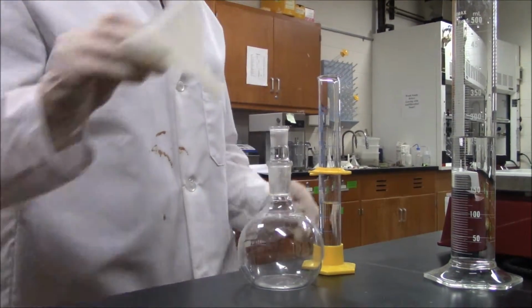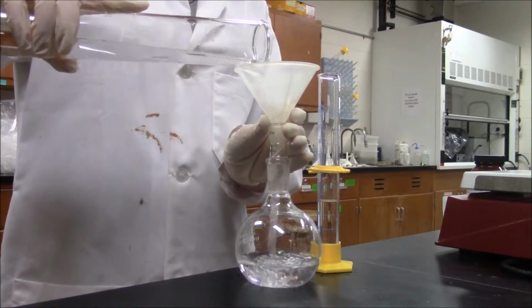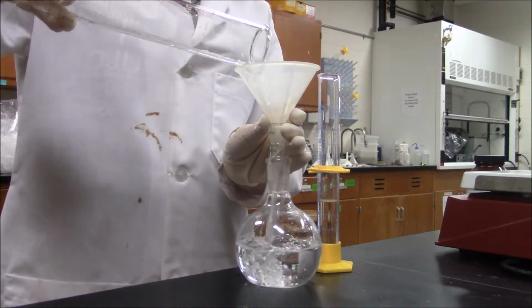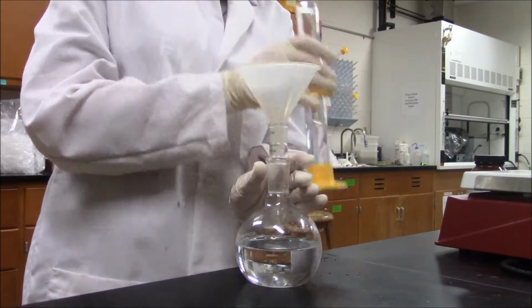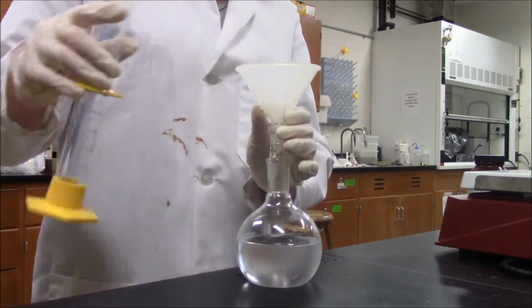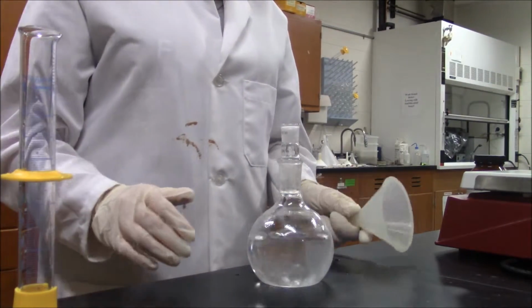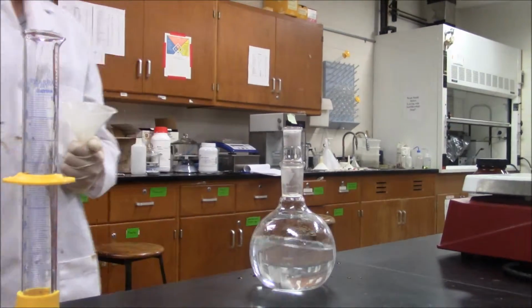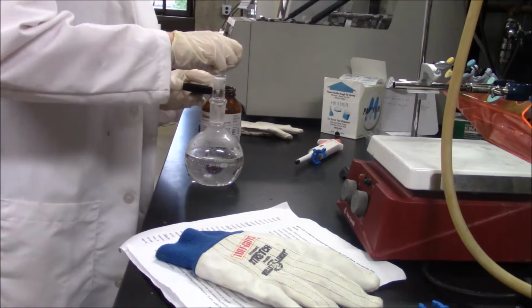Using the 190 proof ethanol, which is 95% volume ethanol, and distilled water, create a solution that is 10% ethanol by mass. Your final solution will contain 40.02 milliliters of 95% ethanol and 268 milliliters of distilled water. These should be combined in a 500 milliliter flat-bottom flask. Adjust volumes accordingly if using 70% ethanol by volume. Add 3 to 5 boiling chips to the flat-bottom flask.